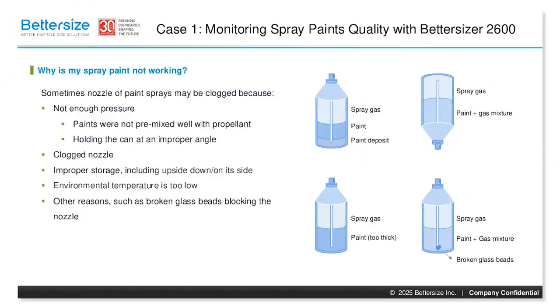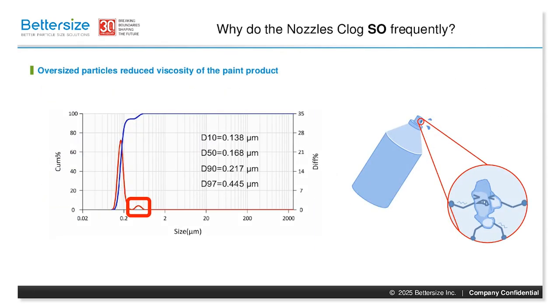This first case study covers monitoring spray paint quality with the Betasizer 2600. A common question — why is my spray paint not working — led to investigating culprits from low pressure and poor mixing to clogged nozzles and improper storage. The Betasizer 2600 identified oversized particles; the distribution curve reveals that peak highlighted in the red box, even when most particles are the right size. These oversized particles disrupt the optimal packing of smaller particles, reducing overall viscosity and leading to inconsistent flow and clogging.